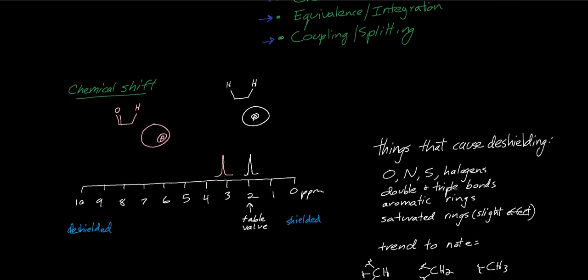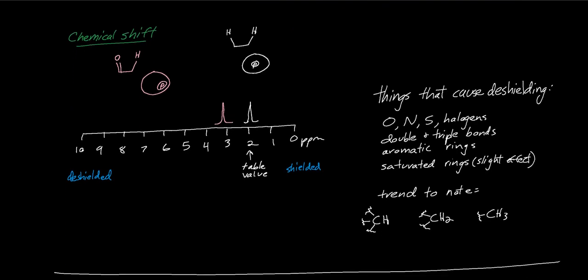So beginning with chemical shift. Chemical shift is an indication of where in the spectrum from left to right the signals appear. Chemical shift is unique to different kinds of atoms in different chemical environments. So if you think about a proton in the center of an atom surrounded by a sphere of electron density.